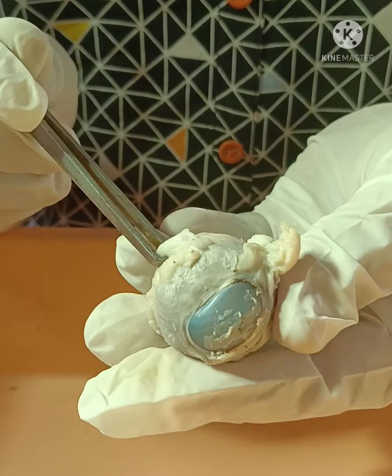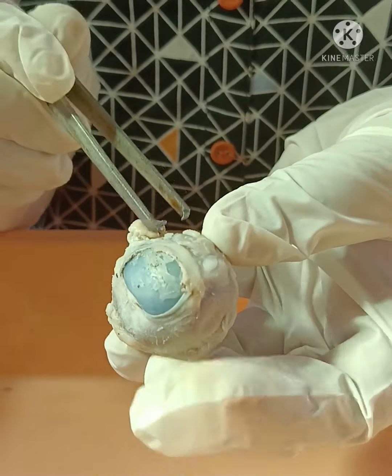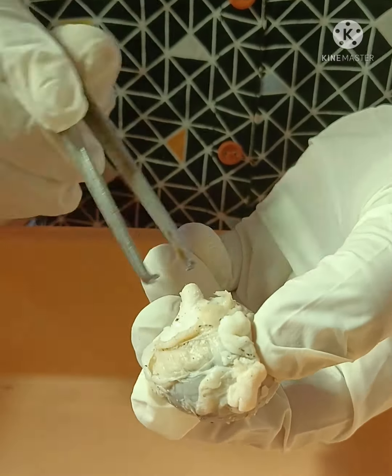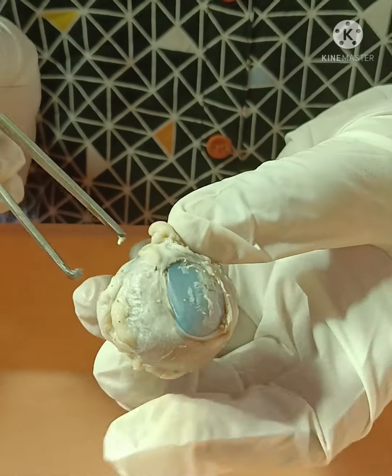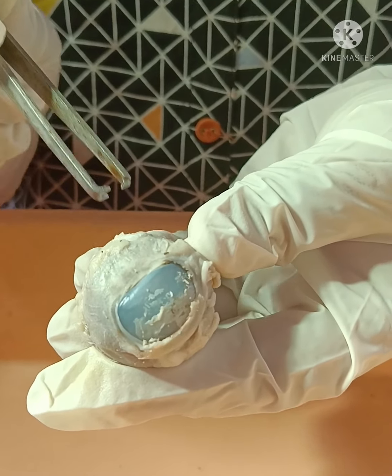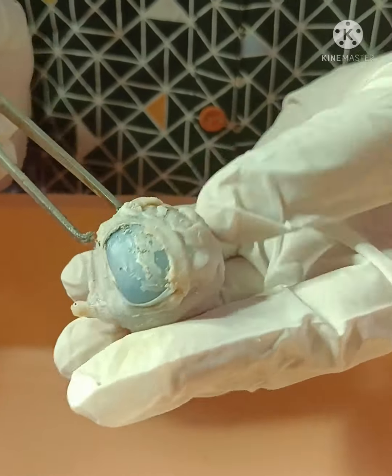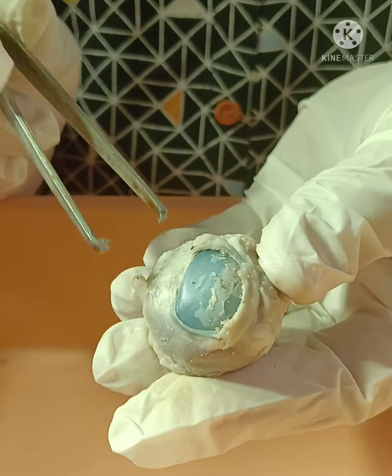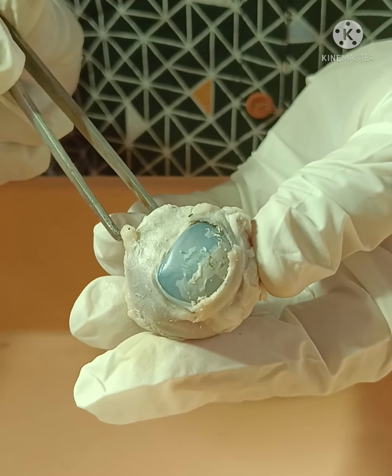This sclera is very dense and tough. It protects the internal ocular contents. Here in the posterior part of the sclera, we can see the optic nerve emerging out. The sclera also gives attachment to the ocular muscles like the superior rectus, medial rectus, lateral rectus, inferior rectus, and oblique muscles. So all these muscles are attached to the sclera.